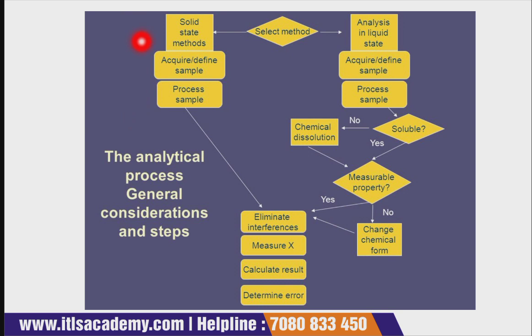I'm just talking about the solid state method first. Then after that, process the sample: first eliminate any interference. If there is any foreign thing, you have to eliminate that. Then you have to measure, as I have told you. Then you have to calculate the result and determine the errors, because there are different types of errors that we will understand later in these slides.